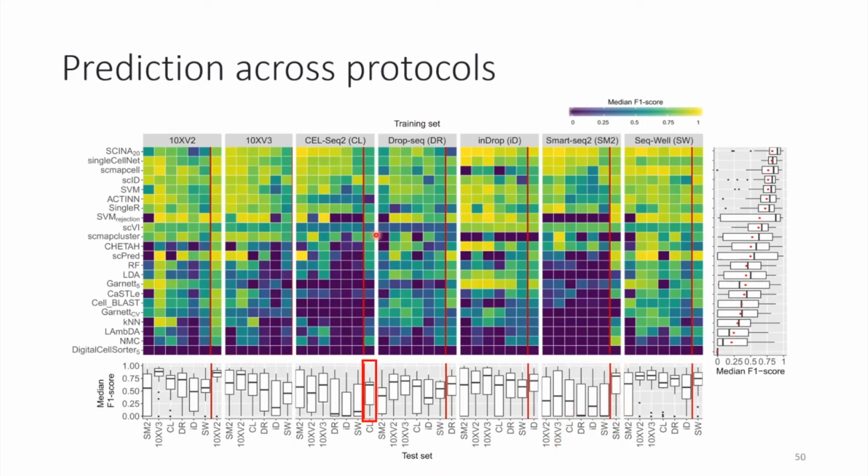One thing we noticed, and it was a bit funny, is that all classifiers are doing particularly worse on the 2 replicates from CellSeq.